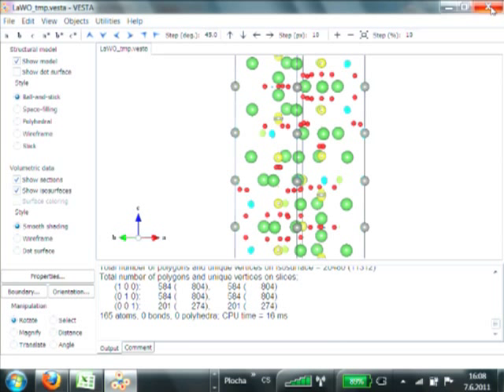Sven Holmell from Stockholm. You mentioned in the beginning the contents of the unit cell. So you put 3 atoms, lanthanum, tungsten, and oxide, and I think you said there would be 3 sets of those in the unit cell.